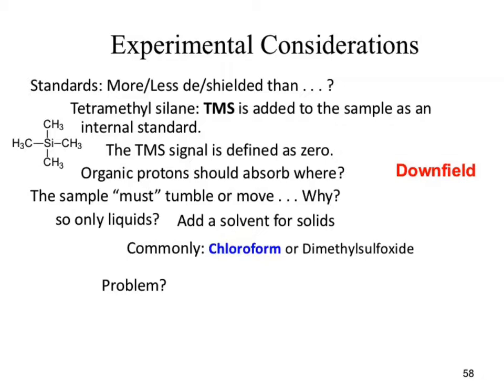If we know the structure of chloroform, notice I said if. If you don't, that's okay. Anybody know the structure of chloroform? No, good. I think that's the structure of chloroform. We're just going to accept it. Let's just pretend that's the structure of chloroform, whether it is or not. We have a bunch of hydrogens. That would destroy my signal. How can I make sure I don't have hydrogens?